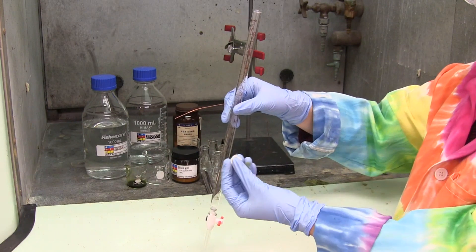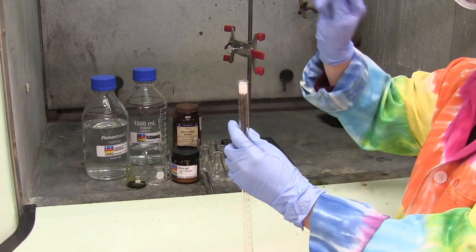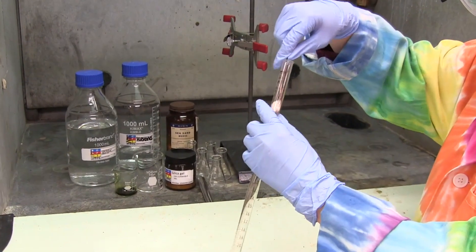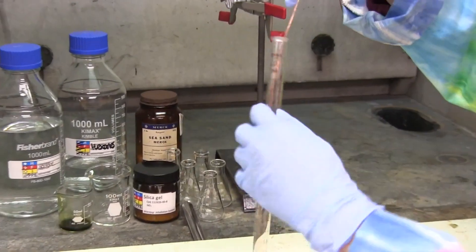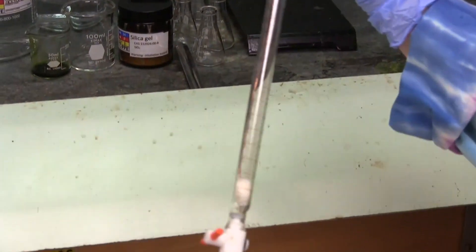First, a wad of cotton that isn't too big or small is packed into the burette using the copper wire. The cotton will keep the silica from dripping out when making the column and performing the elution. The burette is set into a stand with a raised beaker under it.